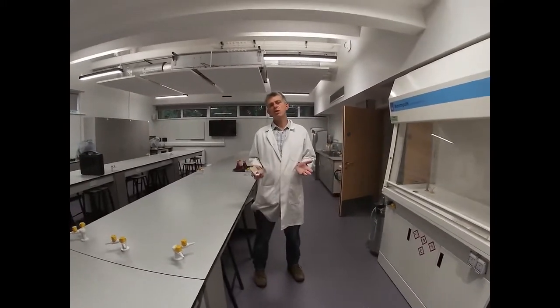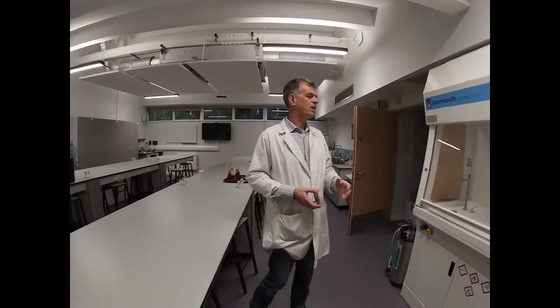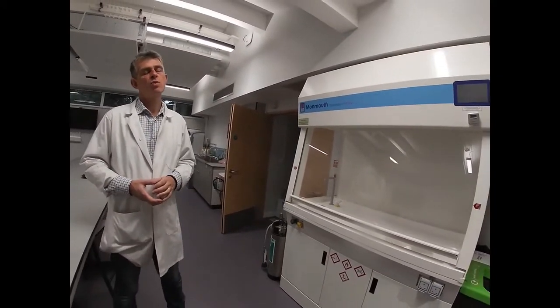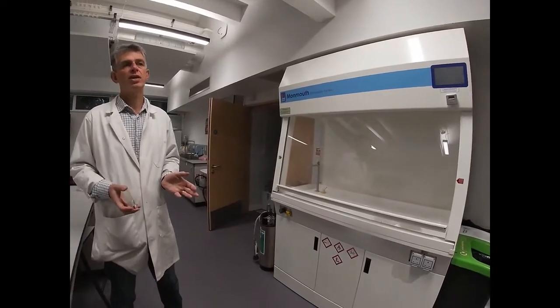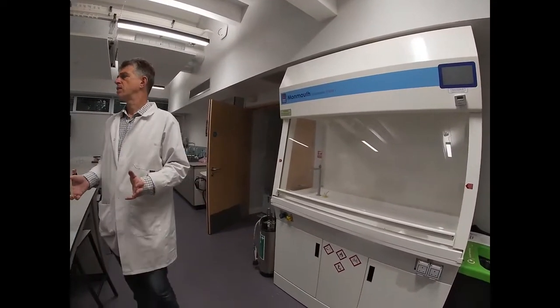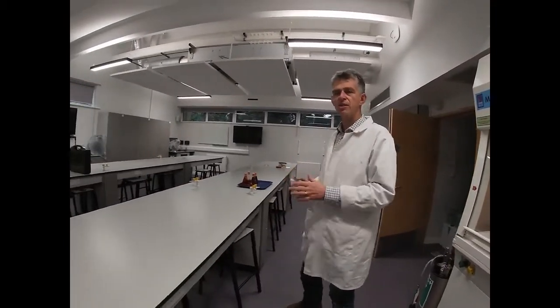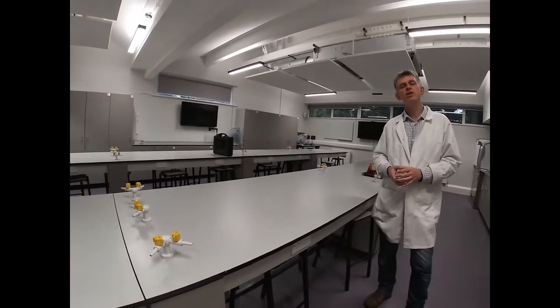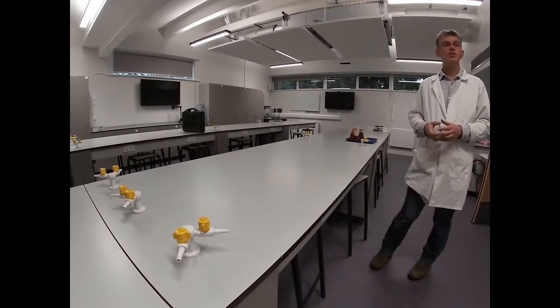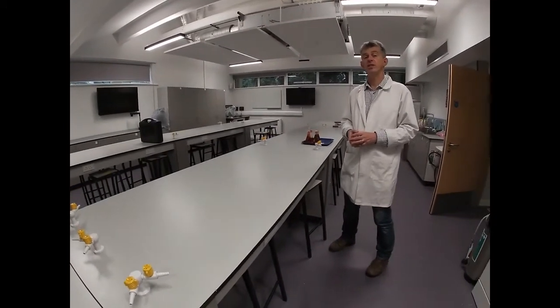Okay, so this is a wet chemistry laboratory, an analytical laboratory. So what we have here is a higher specification fume cupboard where we can do most types of wet chemistry analysis. The bulk of the laboratory just comprises benches. You can see the gas taps. And the gas taps we don't use in archaeology, anthropology or geography. They're used for some forensic applications. So we share this laboratory with the Forensic Studies programme.